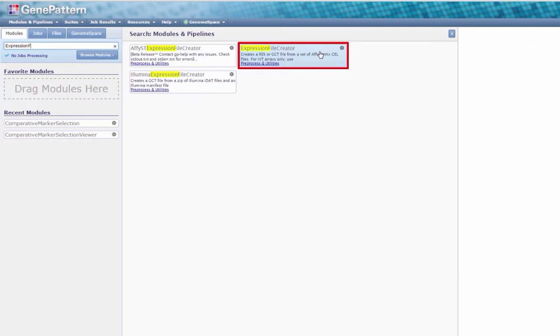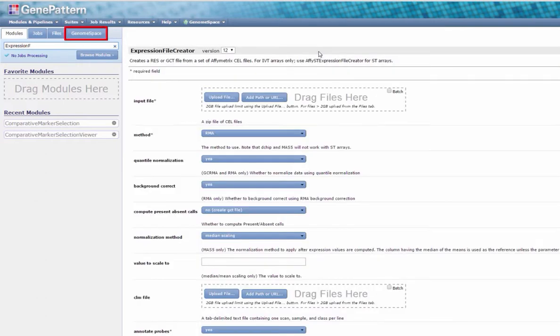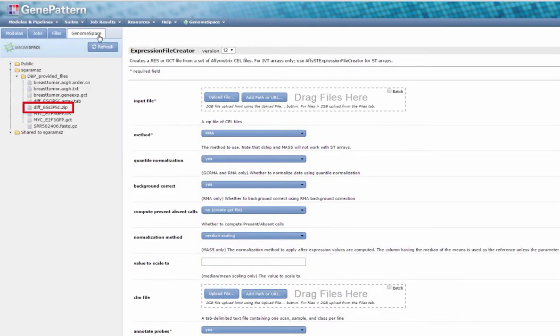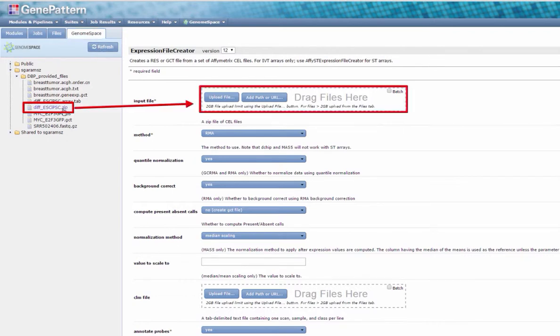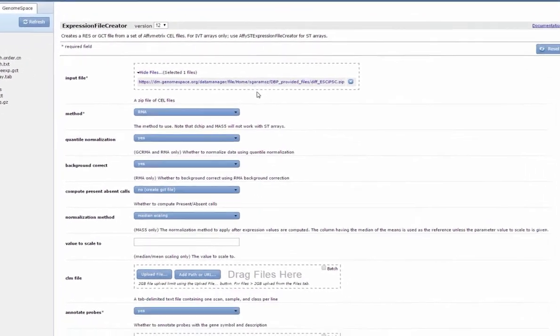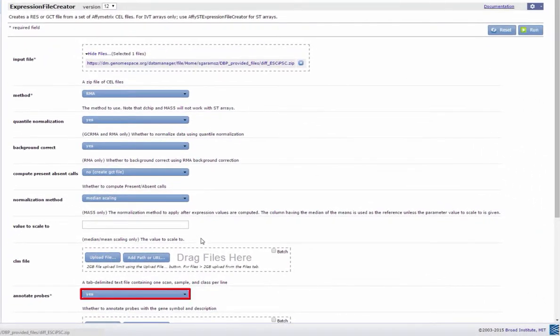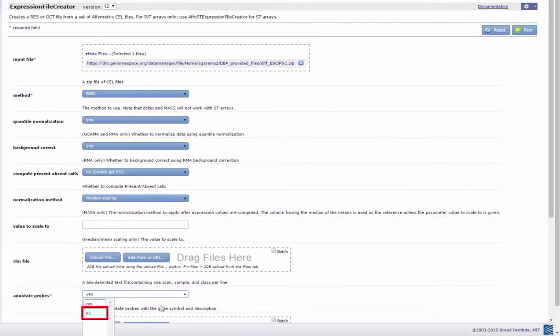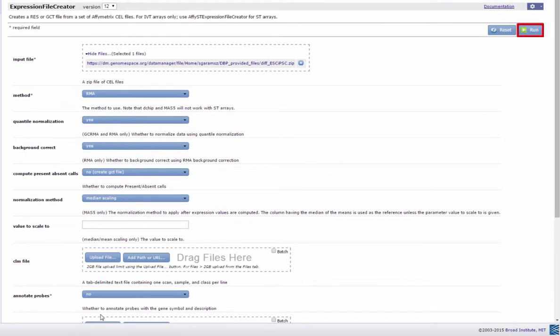Click the Genome Space tab and navigate through your directories to the file diff-esc-ipsc.zip. Click and drag the file to the Input File field. Set the Annotate Probes parameter to No. Click Run to submit the job and await its completion.